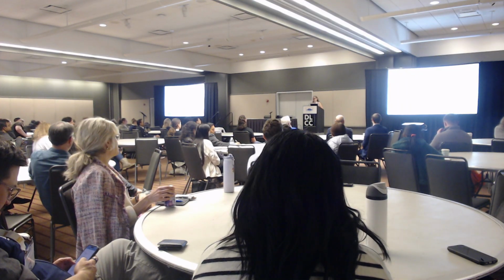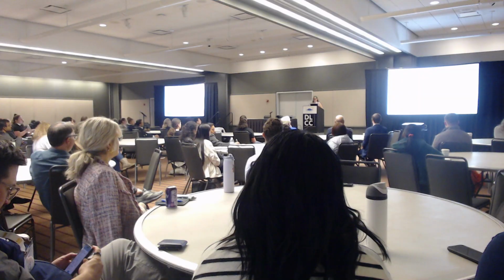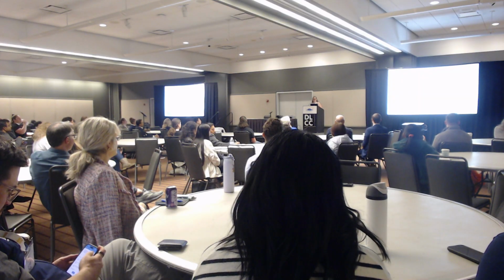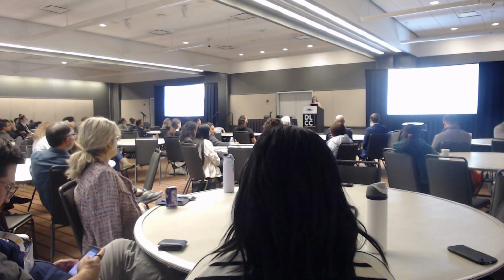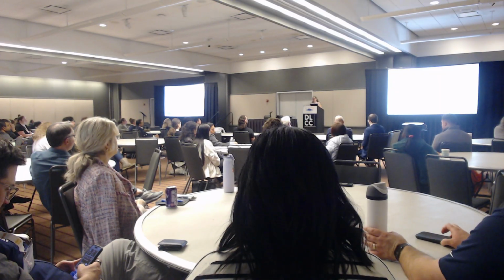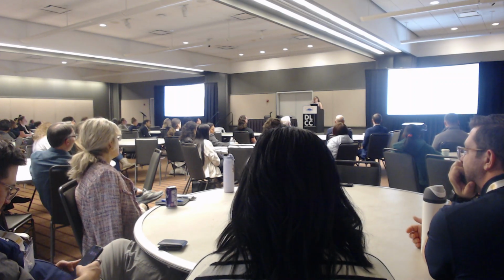But sometimes there are assays that come along when we've got a specific gap that we've identified by talking with researchers, and it looks like the assay could fill the gap, a service we're not able to provide. And as all of you know, epigenomics is not new of the last decade. It's been around for a while.